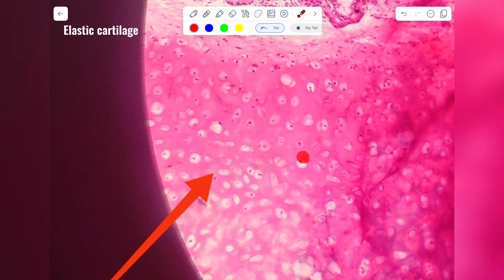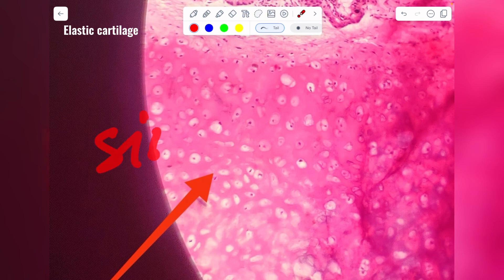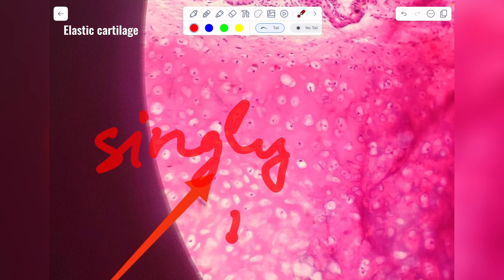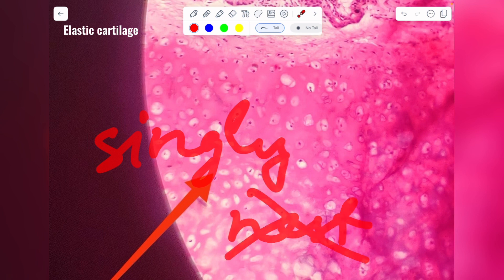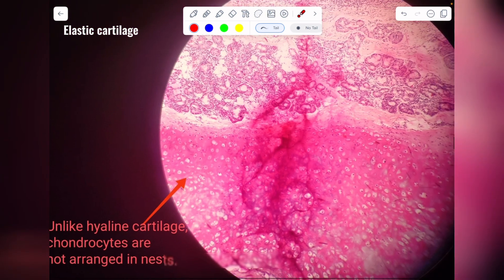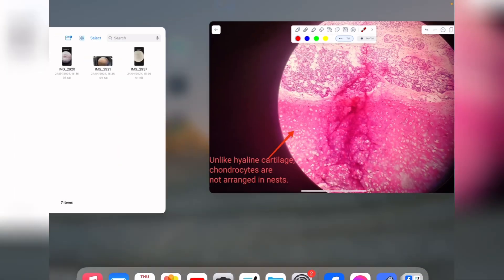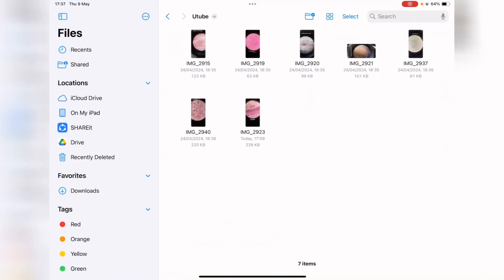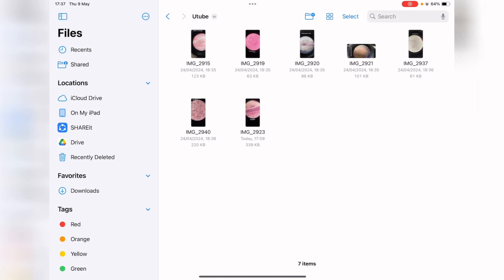In elastic cartilage, first you will find chondrocytes present inside fluid-filled lacunae, arranged mostly singly — nests are not present. Second, the matrix is not clear due to the deposition of yellow fibers. Let me show you even better slides.